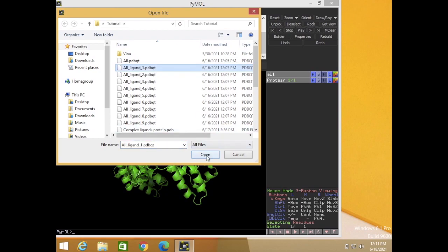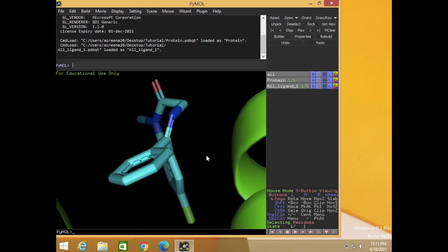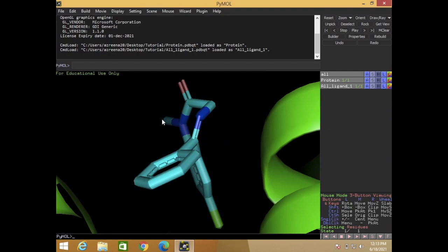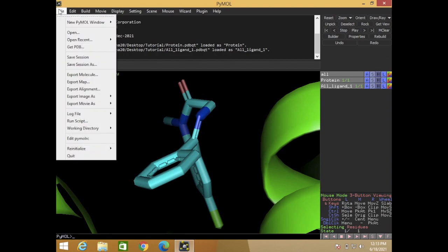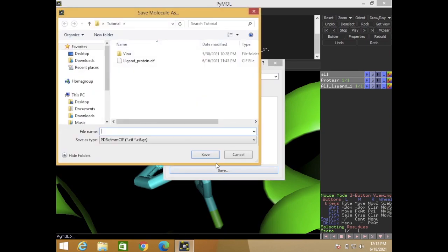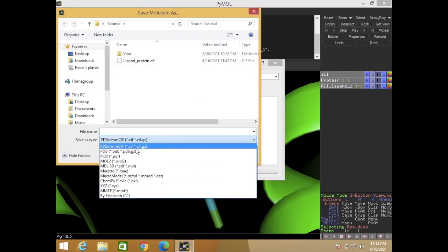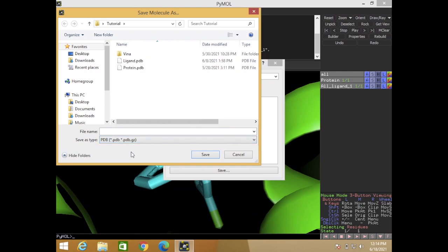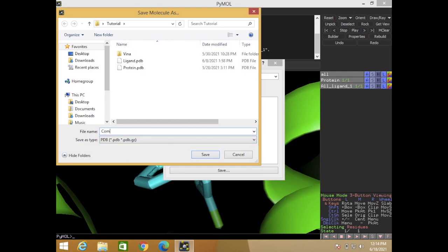This is output from Autodock Vina. I will save this complex into PDB for Ligplot analysis. So file and export the molecule, save as PDB. I will create the name here: complex ligand plus protein.